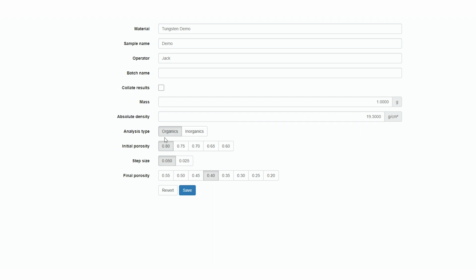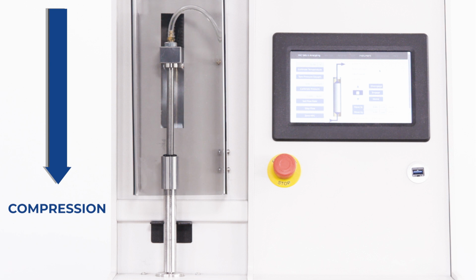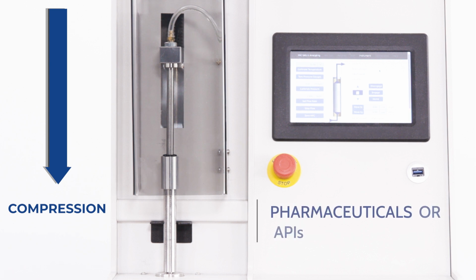In the organic mode, you set the beginning porosity, ending porosity, and steps. The SAS will try to achieve each porosity point by adjusting the height of the piston until it compresses the sample and cannot move any lower. This is typically used for soft materials like pharmaceutical excipients or APIs.